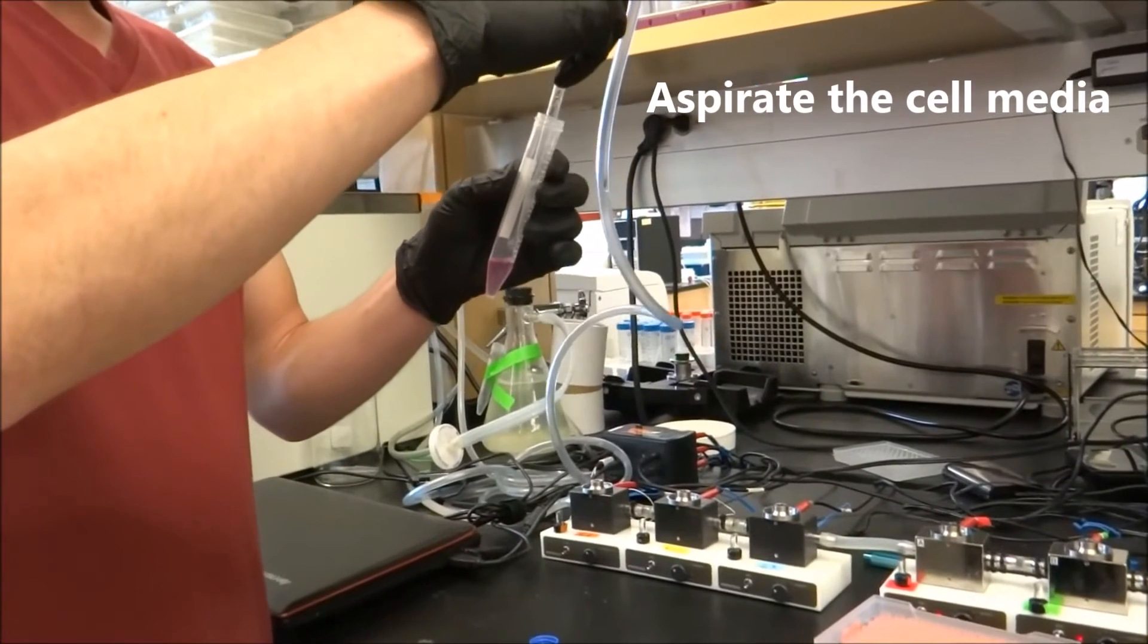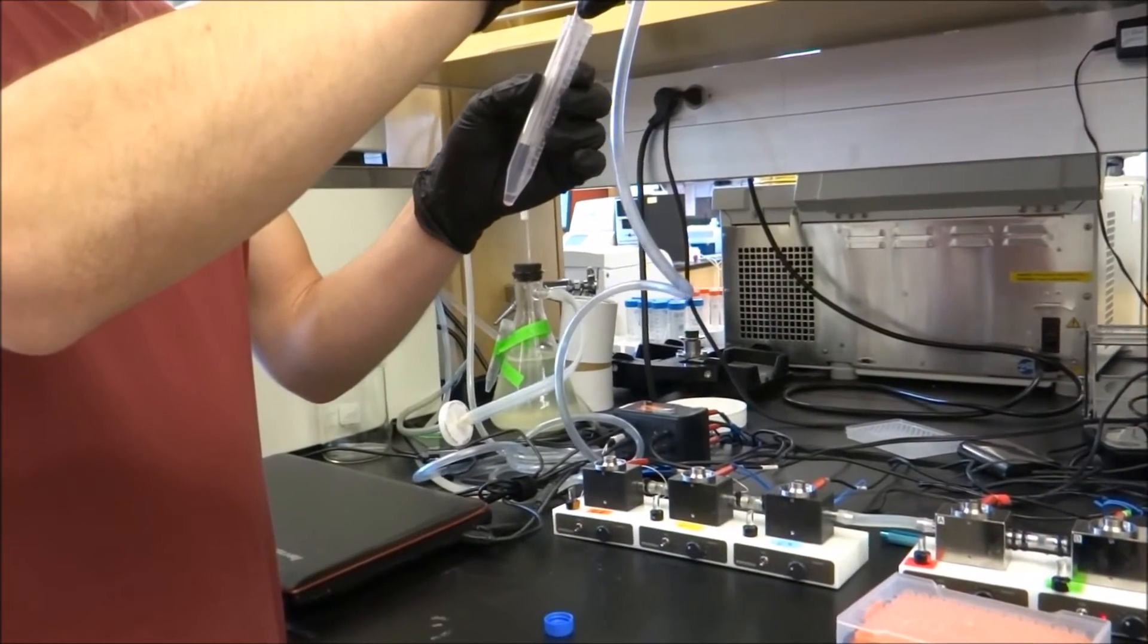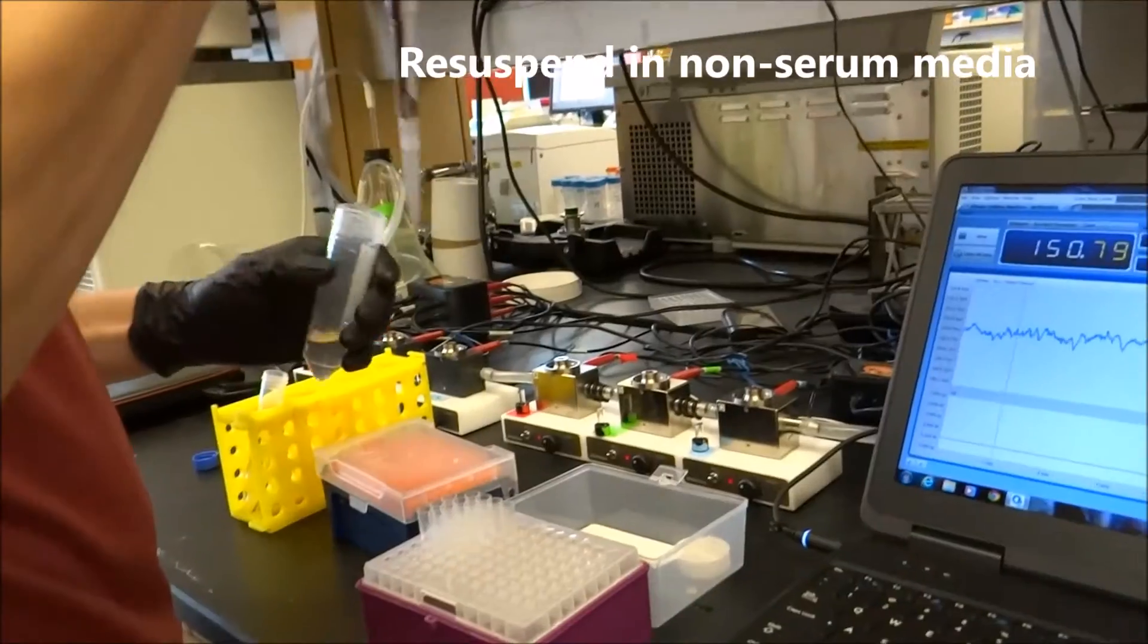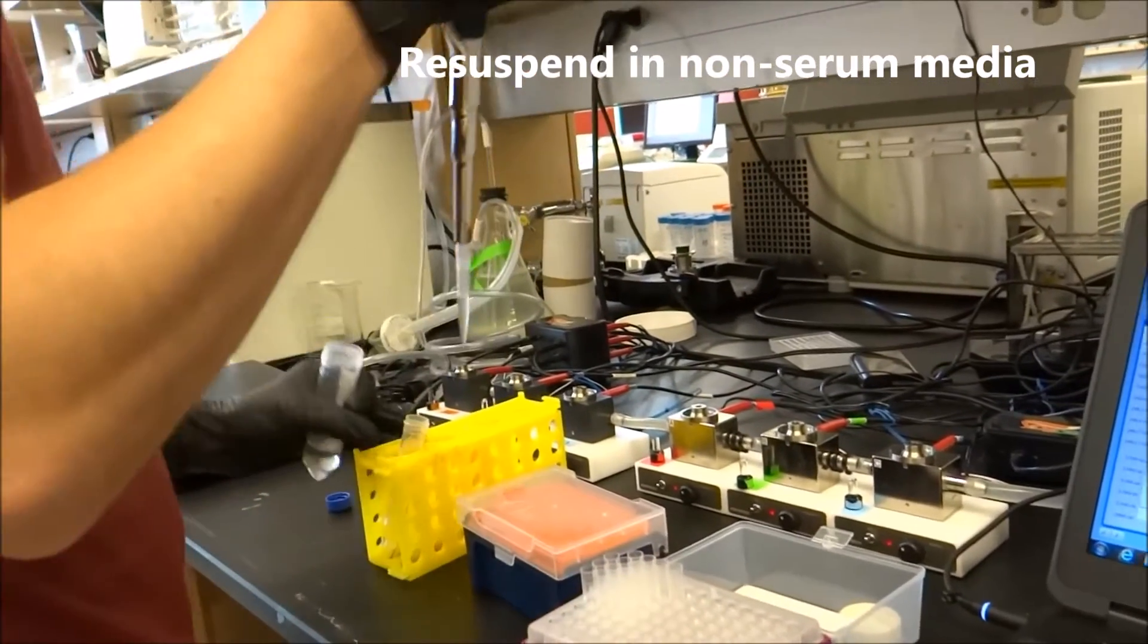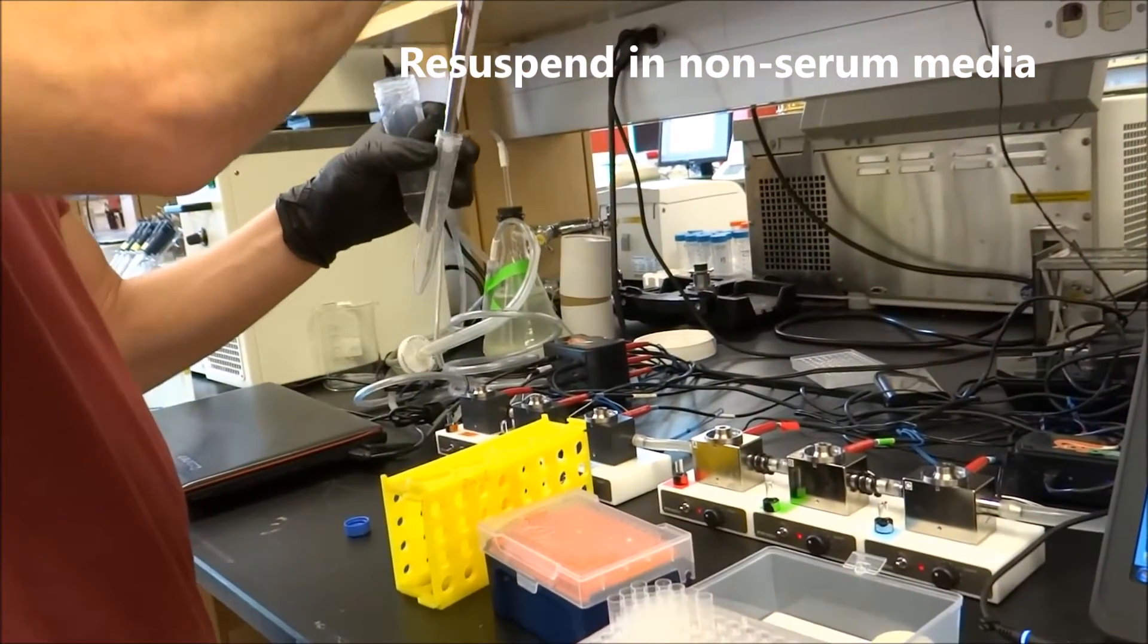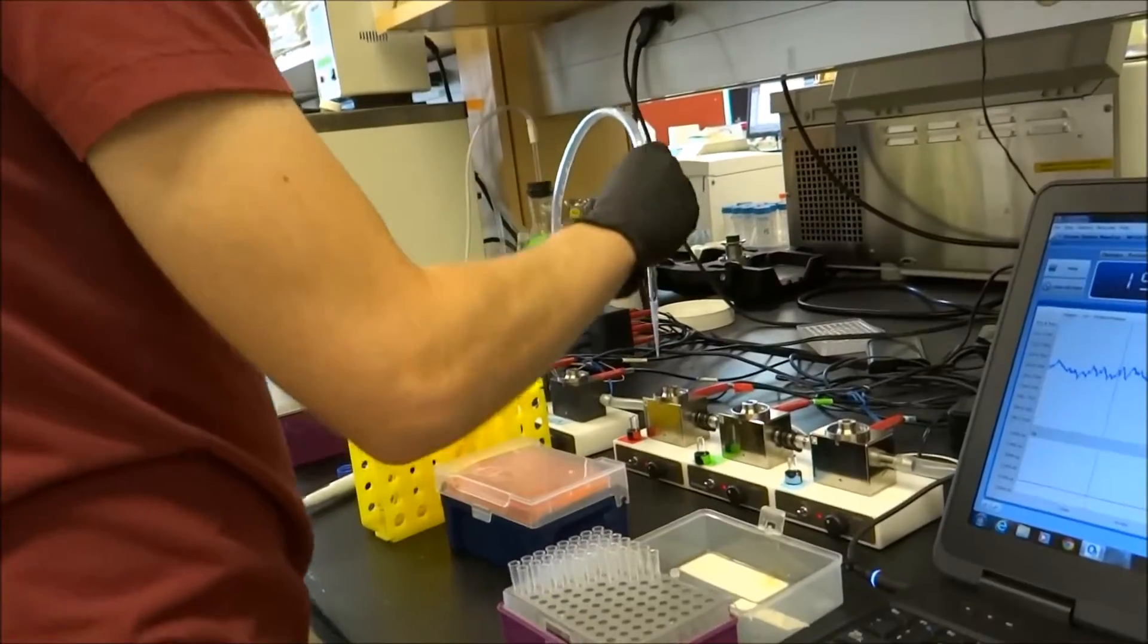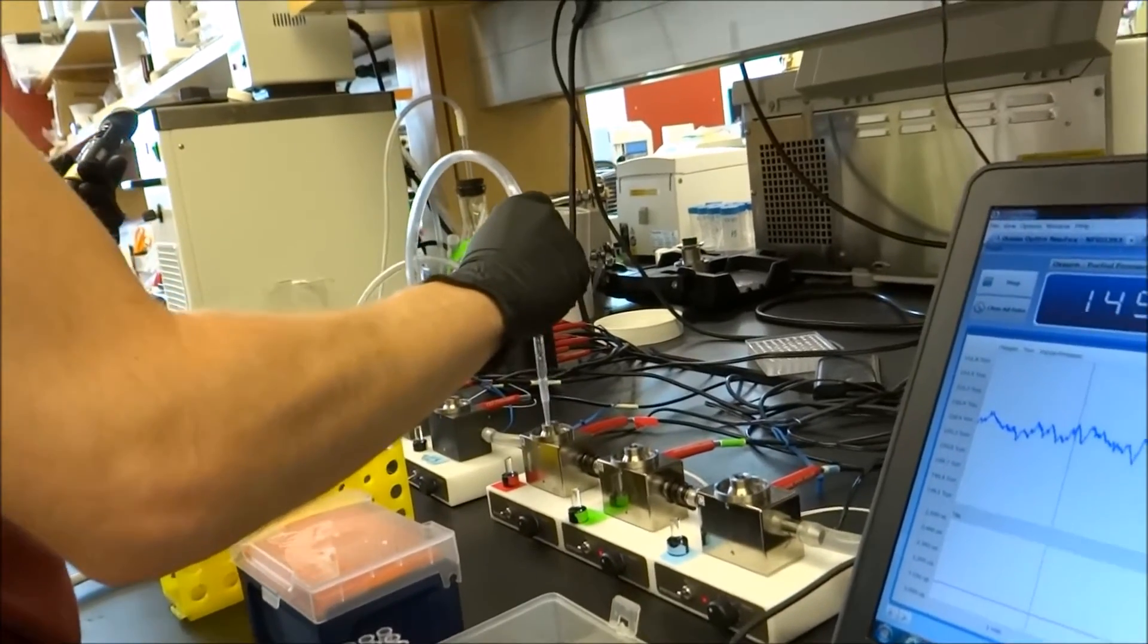Aspirate the media, making sure not to suck out the pellet at the bottom of the centrifuge tube. Resuspend the pellet in a non-serum media. The media used to prevent airflow in the chambers is removed.